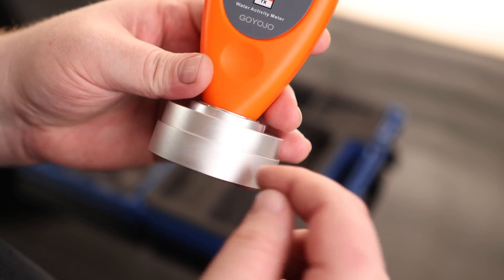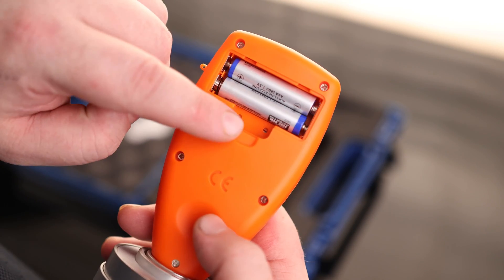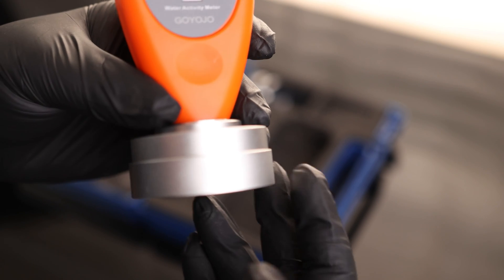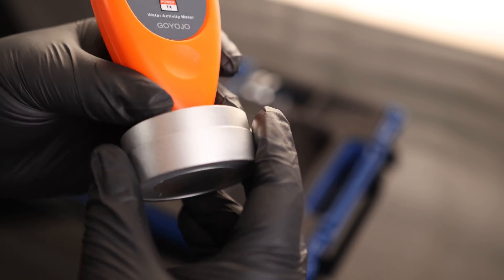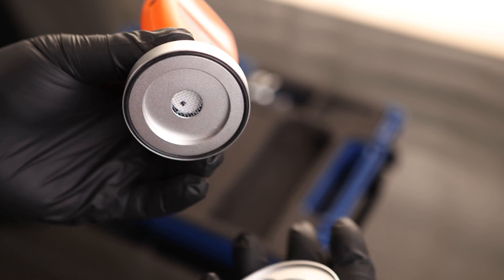It has a plastic body and a metal chamber. Looks like it already comes with a couple of AAA batteries and there are a couple of switches in there — if we need to calibrate we can hit that with a toothpick. When we open up this chamber we want to make sure we're not getting any contaminants inside, so you want to wash your hands or wear gloves. It looks like this one is just magnetic and there's a rubber ring around the outside to make sure we get a good seal.